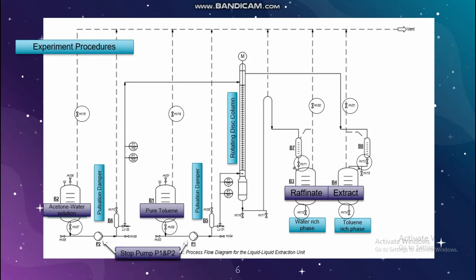Repeat the experiment steps 3 to 10 by turning on the rotating stirrer and set the stirrer speed at 250 rpm, but fix the same flow rate and feed composition throughout the whole experiment. After finishing the experiment, proceed with the general shutdown procedures.